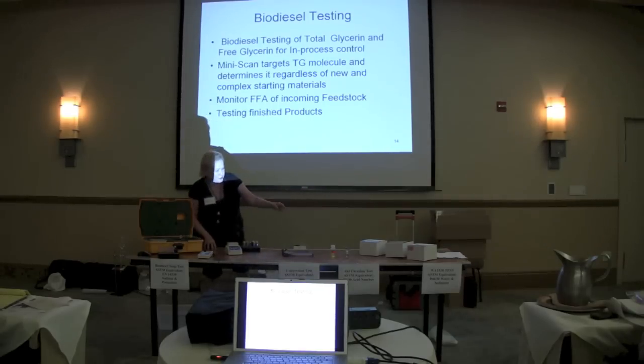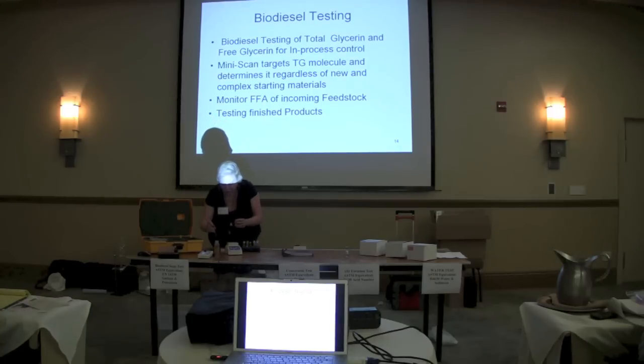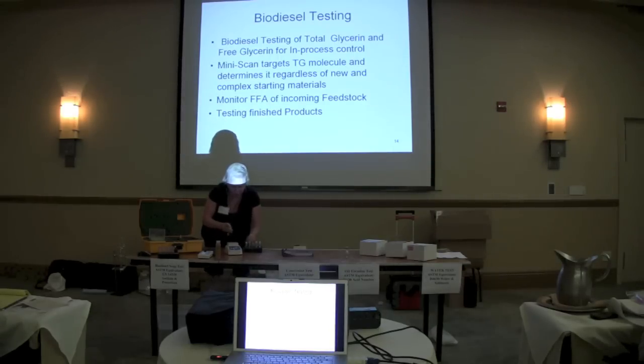So if I wanted to run something like my oil — this is a sunflower or something — I'm simply going to take it and add it right into my testing tube. These are called mini pipetters. They're as accurate as some of the big, more expensive pipetters. They're simple to use. And I'm going to add a detection reagent.